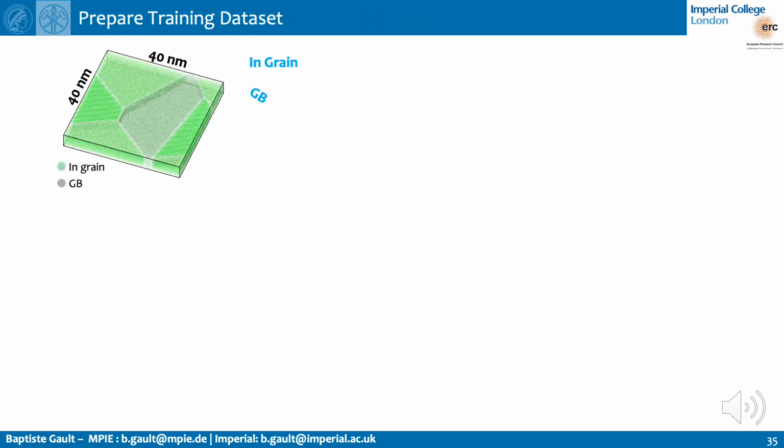So what we wanted to do in that case is, again, use machine learning to determine where these different grain boundaries would be. So we use tools that are typically used for molecular dynamics simulations to set up a number of cells containing grains and grain boundaries. There is a record of where the grain boundaries are and where the grains are. You can see here in this map, at the top, that the white atoms correspond to atoms from the grain boundary, the green ones from within the grains. And so we can play around with these, the misorientation between the grains and so on and so forth.